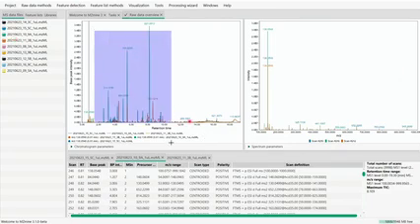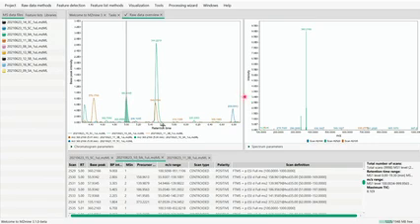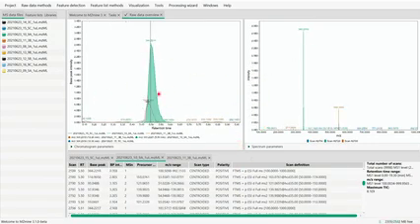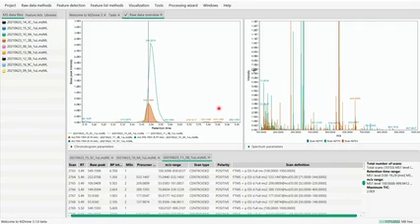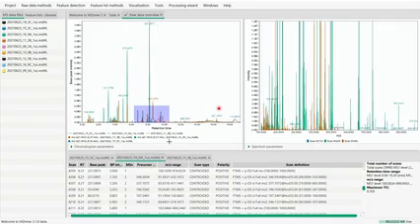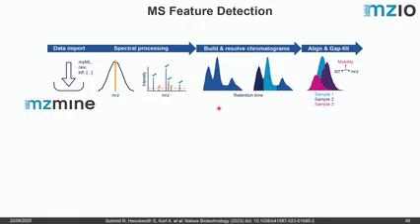Later on, for example, in the software, what you can do is you can load in your raw data. You can click through the software. You can do some basic raw data browsing, I would say. You can do some basic quality control. You can compare different runs along your HPLC, check if everything's stable, and you can also, of course, then do the feature detection workflow in mzmine. And what is really nice is that the whole workflow is really modular.